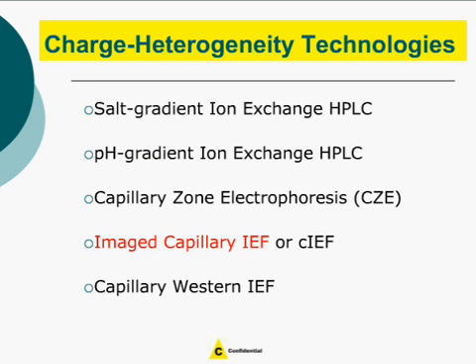For example, if you think about ion exchange and IEF, a sample injected onto an ion exchange column can easily be fraction collected, but there are cases where IEX lacks the ability to provide good separation of charge variants. Whereas CIEF has much better resolution than IEX, separated peaks cannot be collected. For these reasons, we often use multiple methods to fully characterize the charge heterogeneity of our protein of interest.